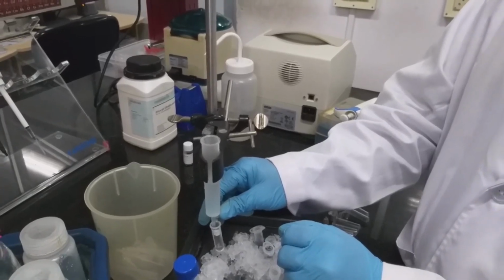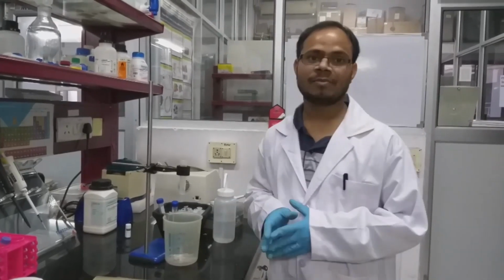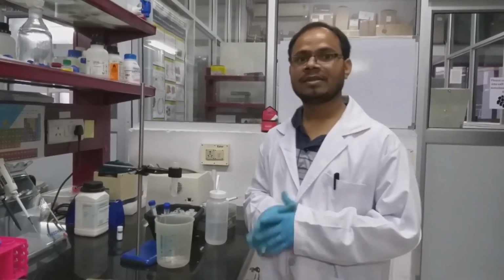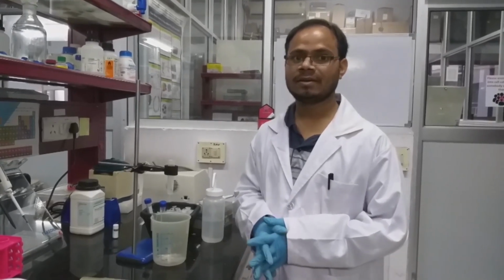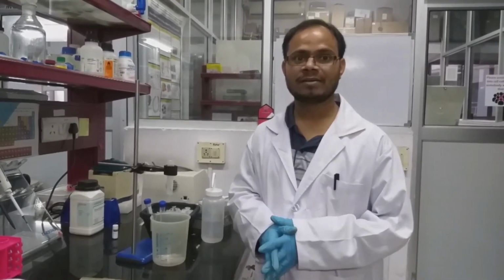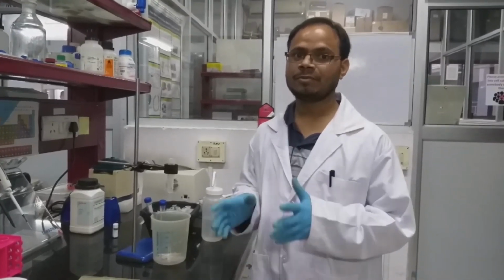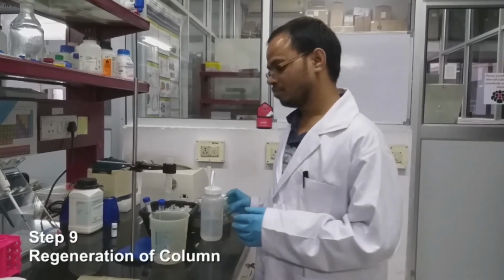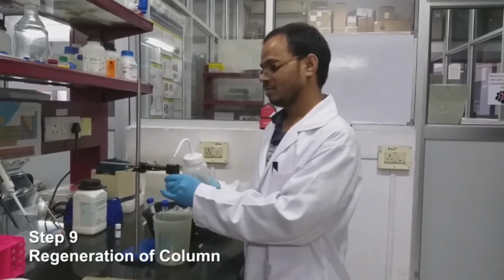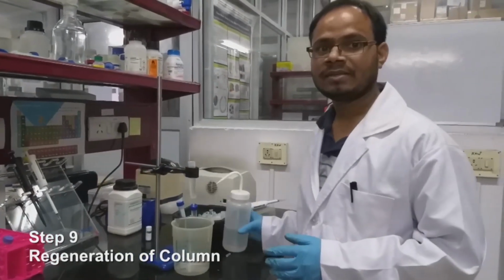After eluting the complete fractions, we have to wash the column with water, then 0.2 normal sodium hydroxide solution, then again water. After the final wash with water, we have to store the beads in 20% ethanol. So I will wash it and store it in the ethanol.